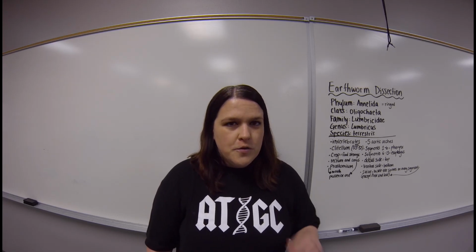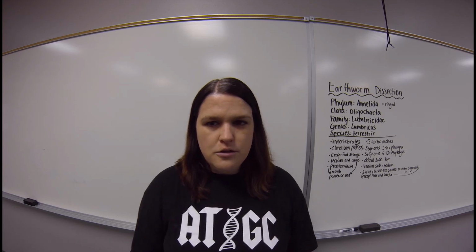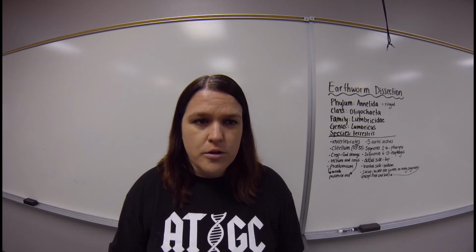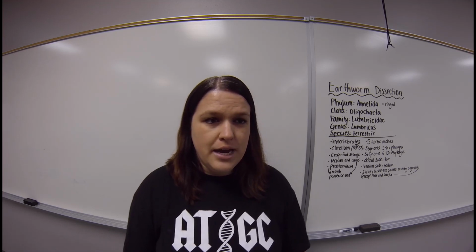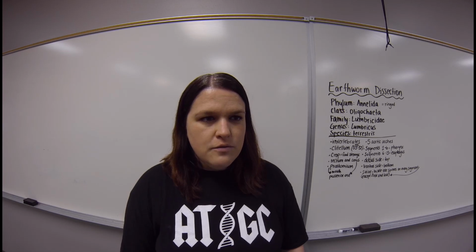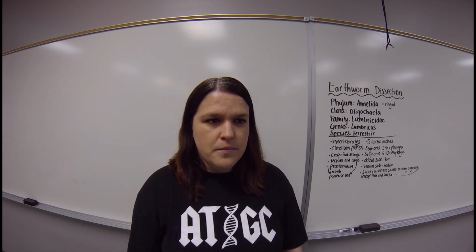So I'm going to give you an intro to that, and I'm going to read to you some information so that you can have that in the back of your mind whenever we actually cut open the earthworm. Among the most familiar invertebrate animals are the earthworms, members of the phylum Annelida. The word Annelida means ringed and refers to a series of rings or segments that make up the bodies of the members of this phylum.